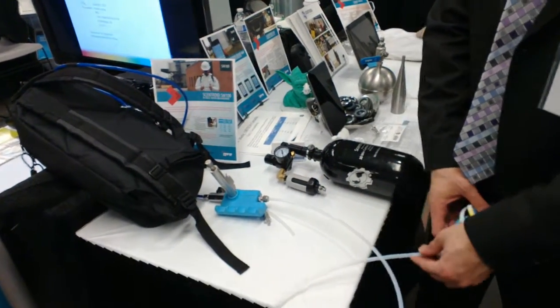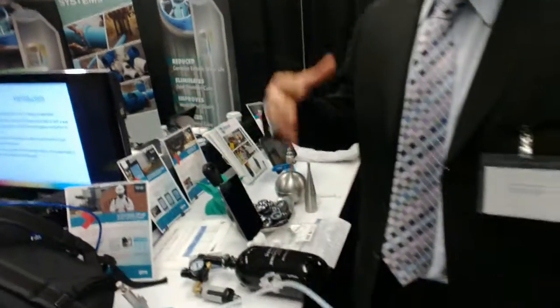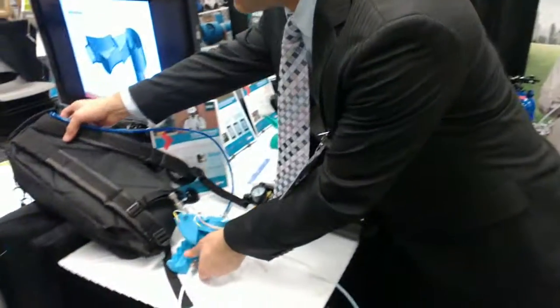My name is Adam. I'm from IDIS. The equipment we make — we make a lot of olfactometers, different stuff, from big ones to small ones. And this one, we use the same principle as our big olfactometers, the six-panel EN olfactometers. We try to keep exactly the same principle of operation. What we have here is a portable olfactometer.